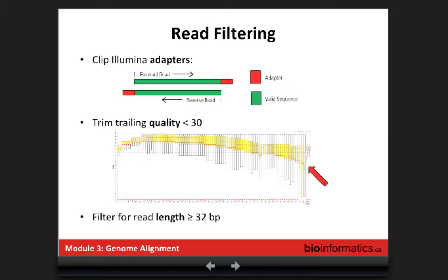Can you explain what soft clip means? So soft clip is when you align your reads. The aligner can do many things, and it can break your read into different pieces. It can say, okay, for this piece I don't find a place anywhere in the genome, so probably it's not a genomic region. So instead of leaving it there, it just marks the sequence, for example the last 10 bases, as non-genomic, so don't use it in subsequent analysis to look for variants or anything. It's just additional information you add to your alignment to tell you that these 10 bases, or whatever number, should not be used because they are not part of the genome.